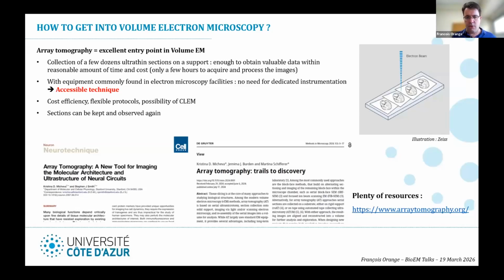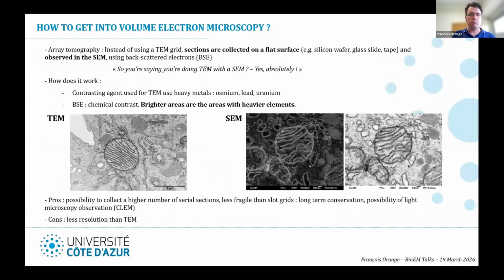And Kristina Micheva and colleagues Jemima Burden and Martina Schieferer published a paper 2 years ago, still on array tomography, just to mention once again that array tomography is still relevant. You have a website, arraytomography.org, where you will find, if you're interested, a lot of resources on it, protocols, tricks, and everything. A very useful website.